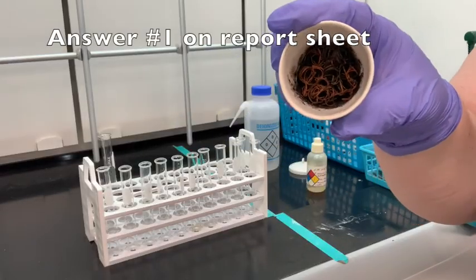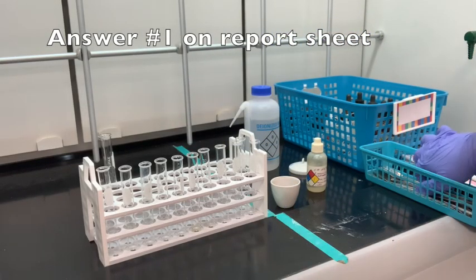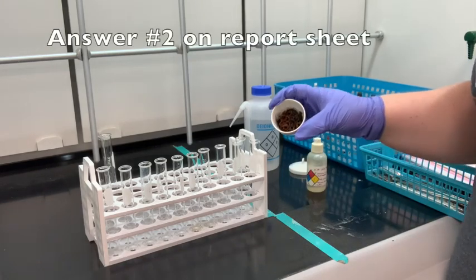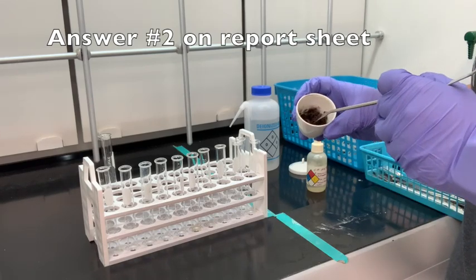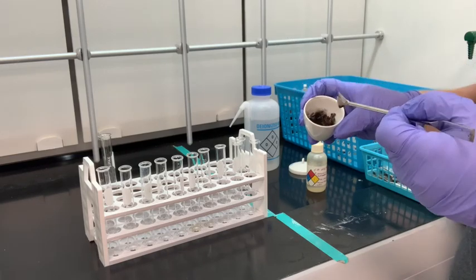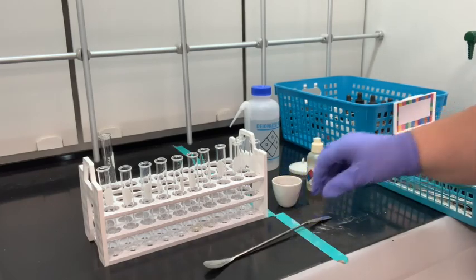Does this resemble copper? Is it possible to bend this without breaking it? I don't really want to stick my fingers in there, but if I just use my spatula, you'll see that when I do it, it breaks. It breaks up pretty good. It is not flexible like you would think copper wire would be.